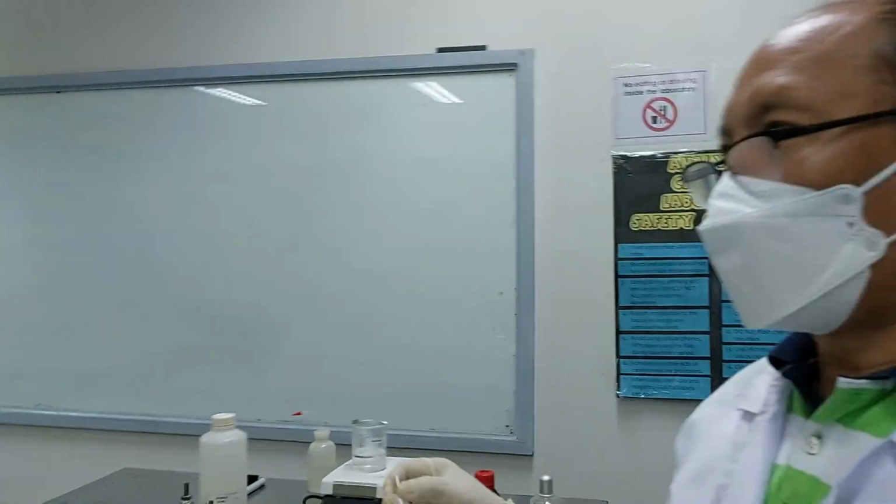Here we cannot observe a precipitate because we have water in the sodium hydroxide. And you know sodium acetate is soluble in water. That's why we cannot observe it. But we can observe the smell of alcohol because the other product is ethyl alcohol. And you know the smell of ethyl alcohol. We cannot observe any change in color, but Ma'am Laika will smell. Ma'am Laika, check if there is a smell of ethyl alcohol.